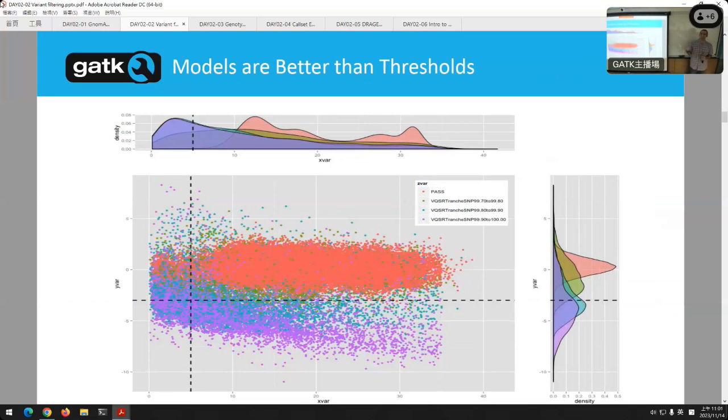Then you can say, I'll choose a new cutoff. I want to make sure I have no false positives, so I'll choose only the things that score at 90 or above. Or I want to make sure I don't miss that one variant that's causing the disease, so I'll take the things that are more flexible and more liberal. I'll take things that score 80 and above, for example. And you can do that. You can set your own threshold with these models now.